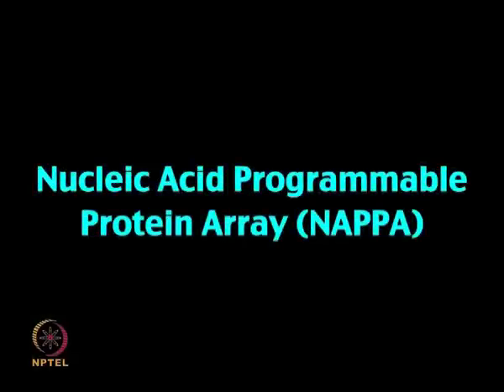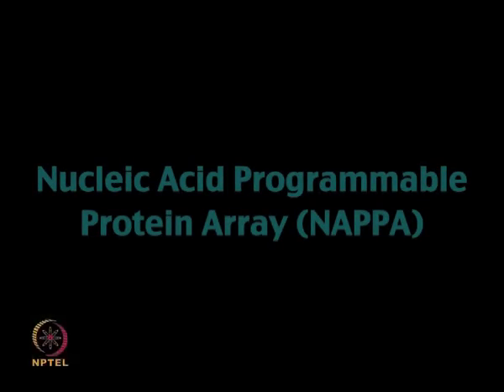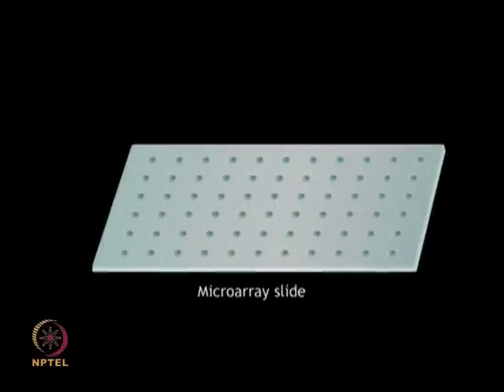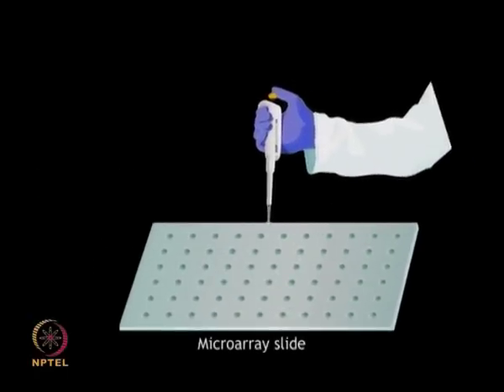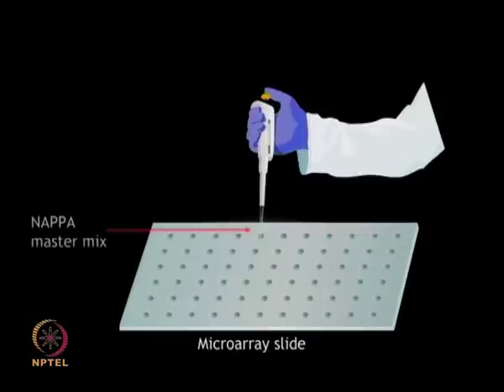Nucleic acid programmable protein arrays, or NAPPA. In the NAPPA method, an aminosilane coated glass slide forms the array surface.